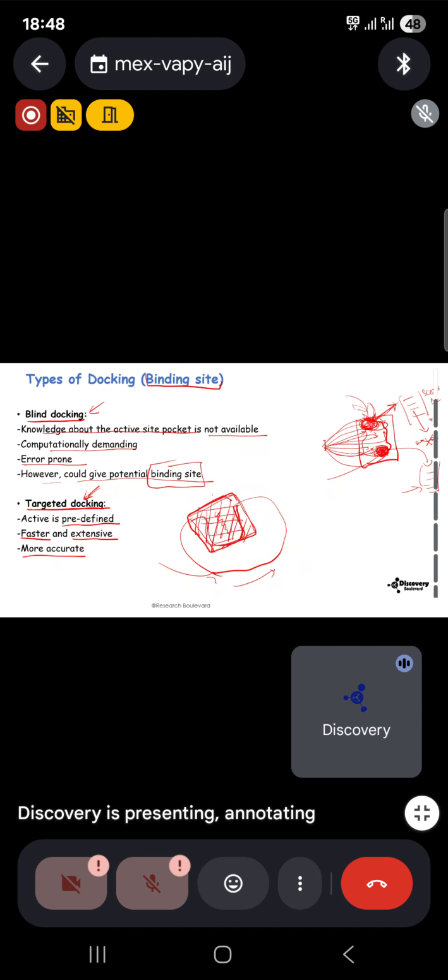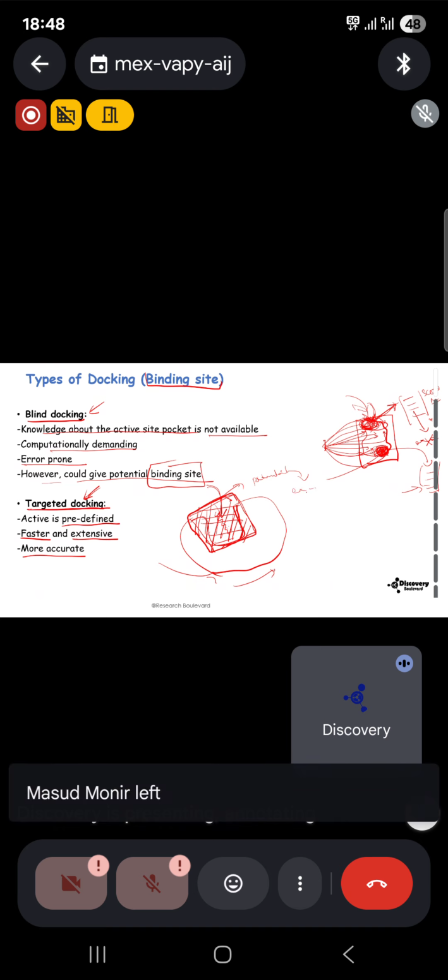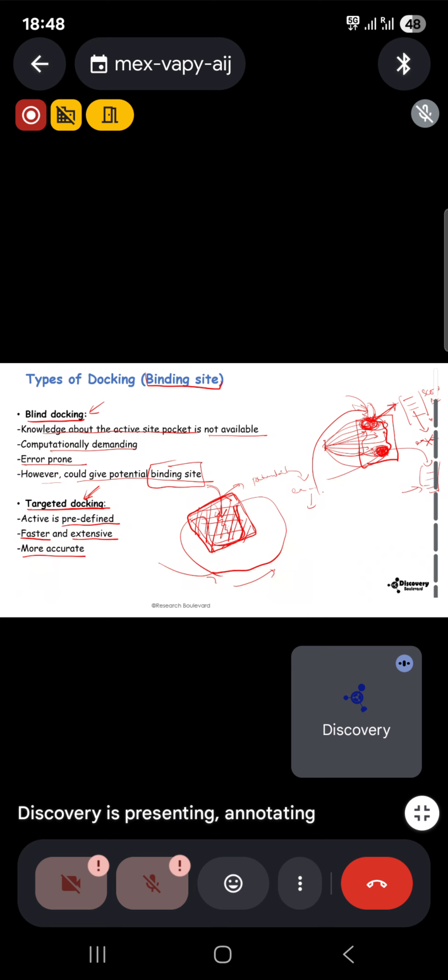where the active site pocket is. Once you see that the molecule can fit properly inside the pocket and get a good score, the potential of that molecule getting the experimental activity may be higher than with this kind of docking procedure, blind docking procedure.